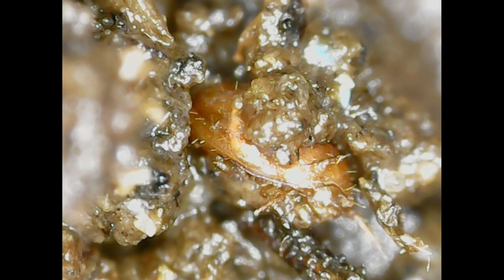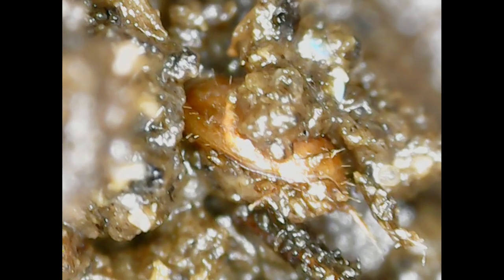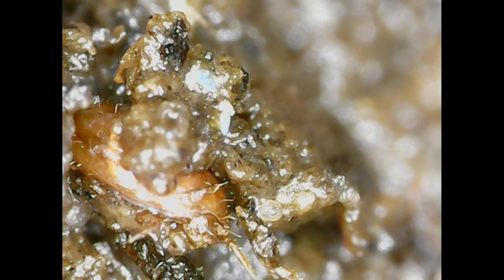Okay, this is the closest I could zoom in on a mite. He's kind of buried in there. Since I'm not working with a flat surface here, it's really hard to get a whole field of view focused. Slightest movement messes with things. But I just wanted to see how close I can get, see if I could see anything smaller than mites living in there, because I assume there's all sorts of cool stuff. What is that next to it? Oh, there's definitely things moving in the water.